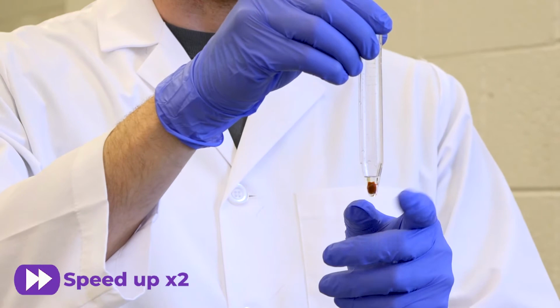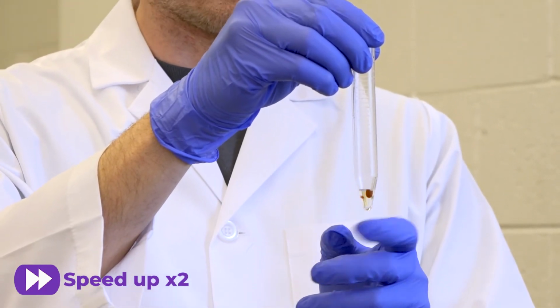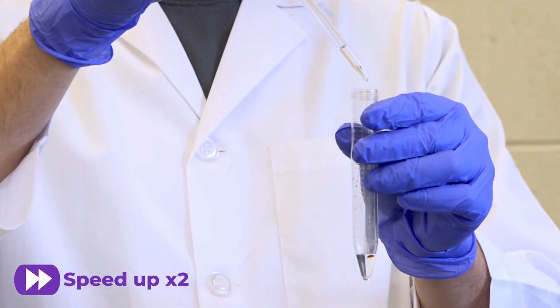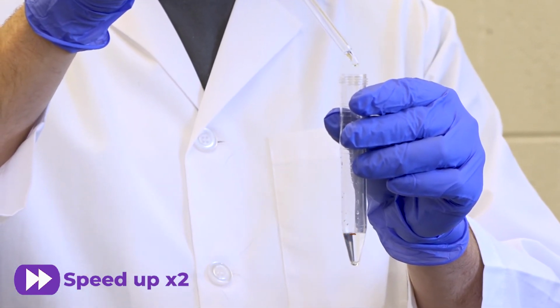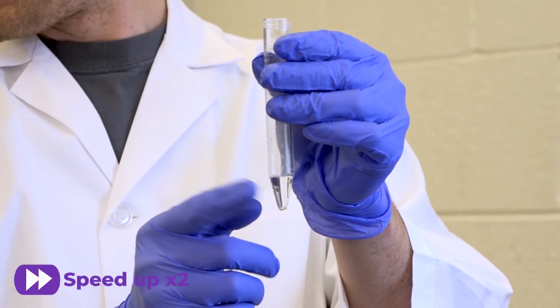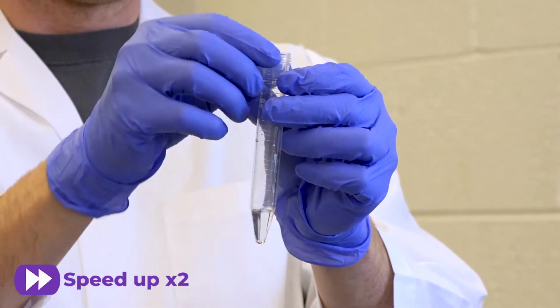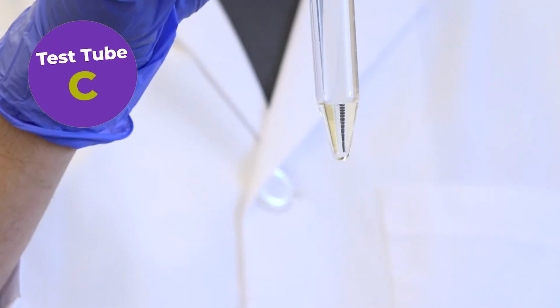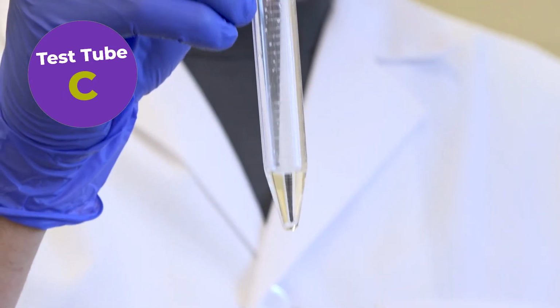You may need to stir this with a stir bar or shake it a little bit to get the solid to dissolve in the nitric acid. If you need to, you can add more nitric acid to dissolve the solid. So now that it is dissolved, we can label this test tube C and set it aside for later when we will do spot tests to verify that this is indeed iron.